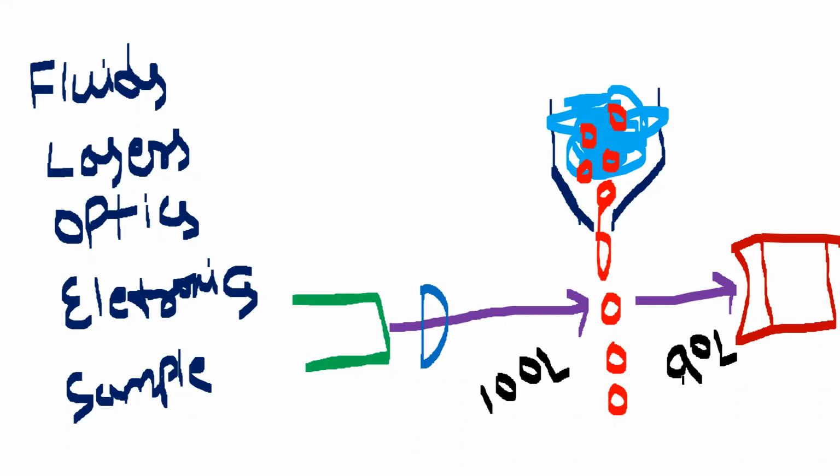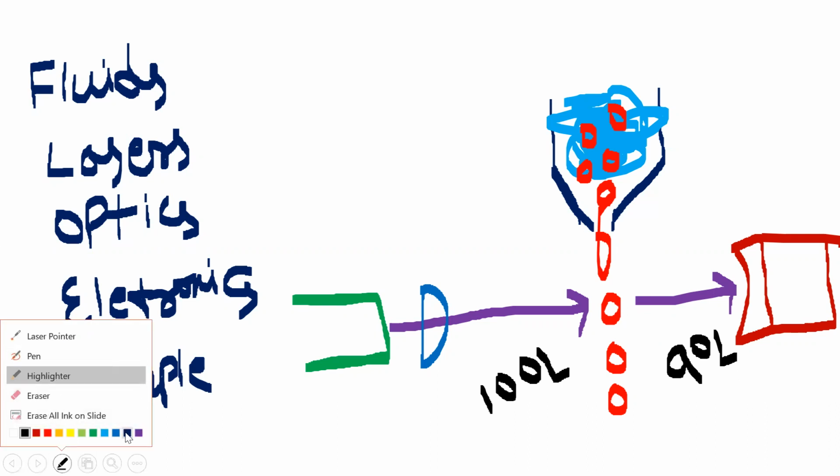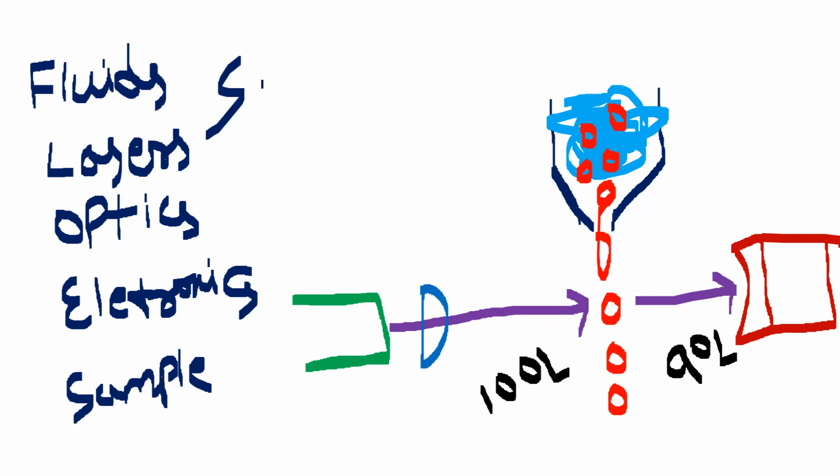Why has the light intensity decreased? The reason is that 10 lumens of light has been blocked by the cell. That's why I detected only 90 lumens of light. So this is called forward scatter. Here we have two types of scattering. I'm writing here: light scattering. This light scattering is of two types. One is forward scattering, FS.